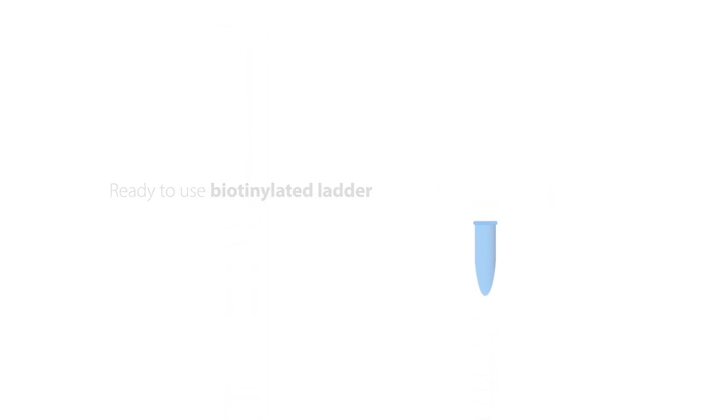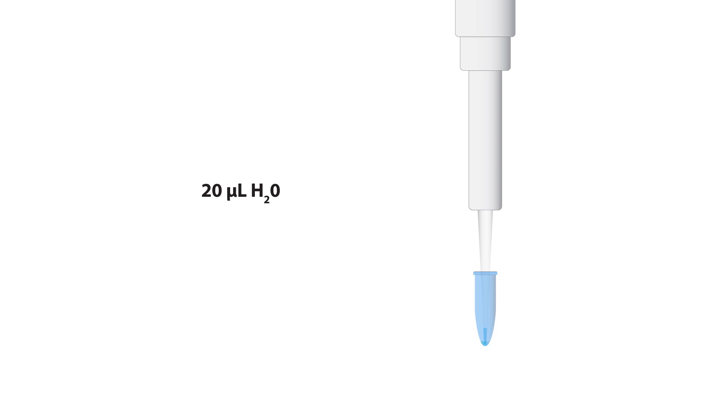To prepare the biotinylated ladder, add 20 microliters of deionized water to the blue tube and mix by pipetting up and down.